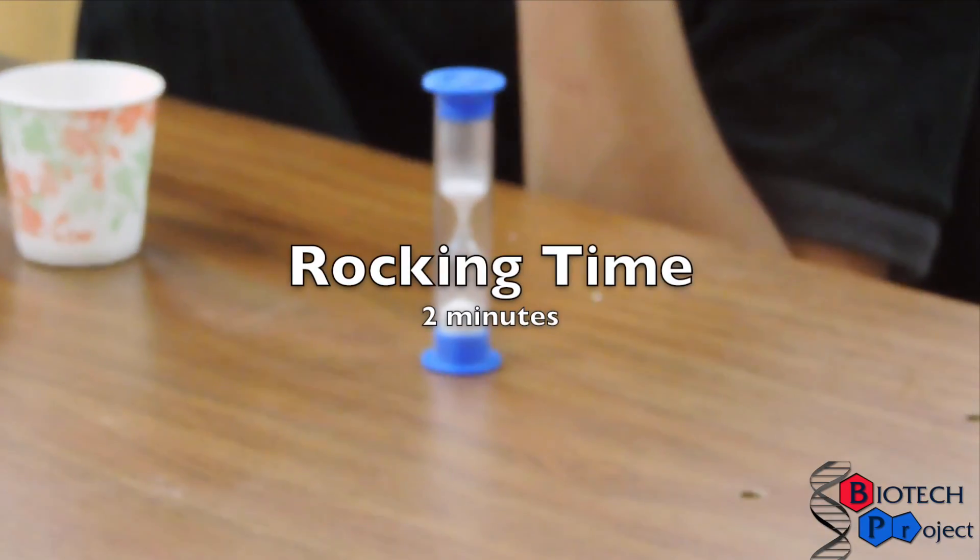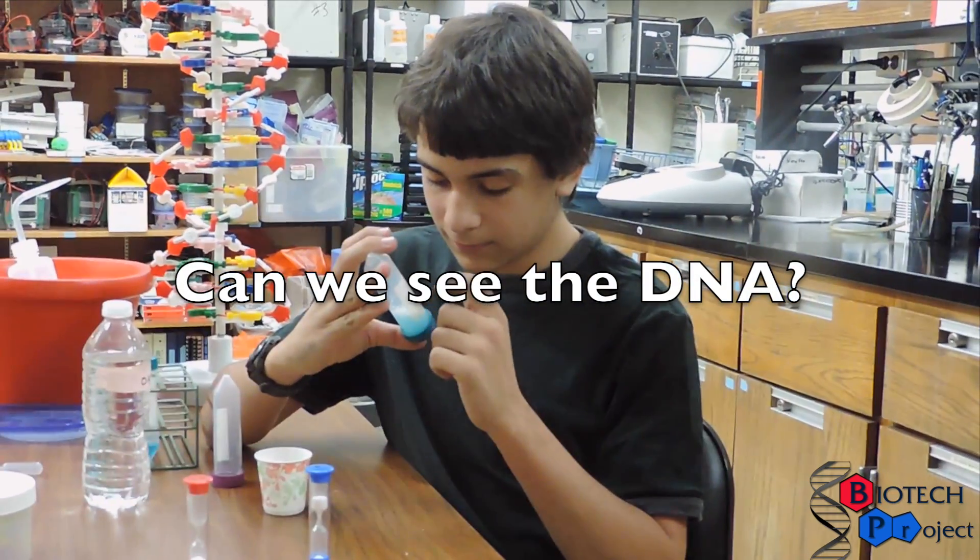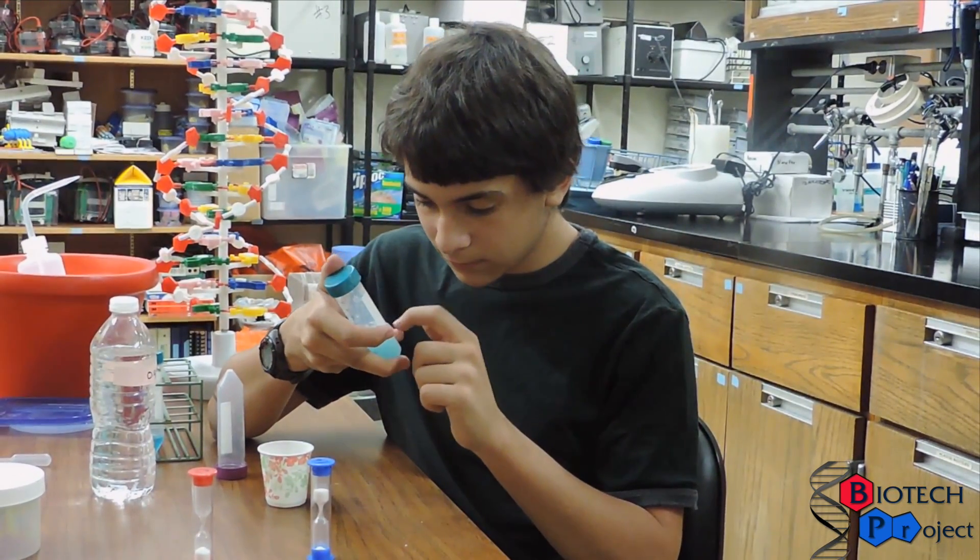As you gently rock your tube, the detergent is reacting with many cells at once to break down the phospholipid bilayers of both the cell and the nucleus. This allows us to be one step closer to seeing your DNA. Rocking time is two minutes.